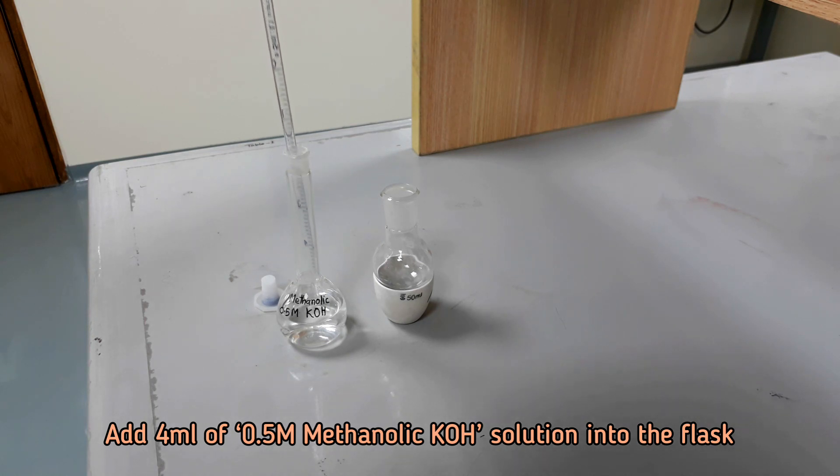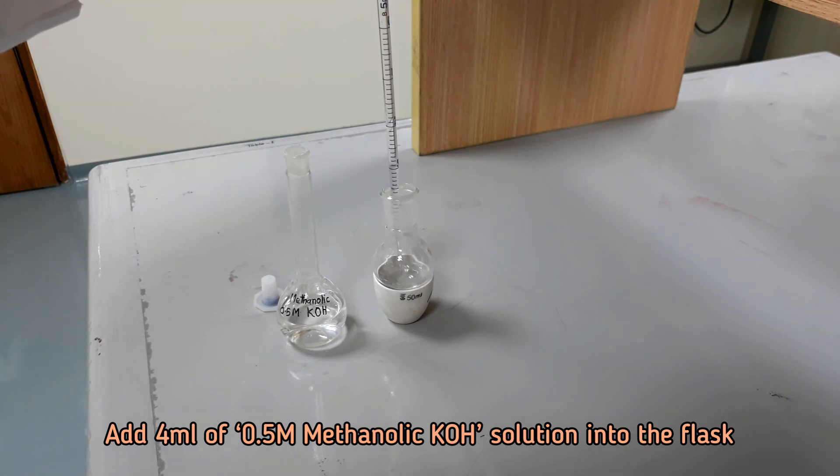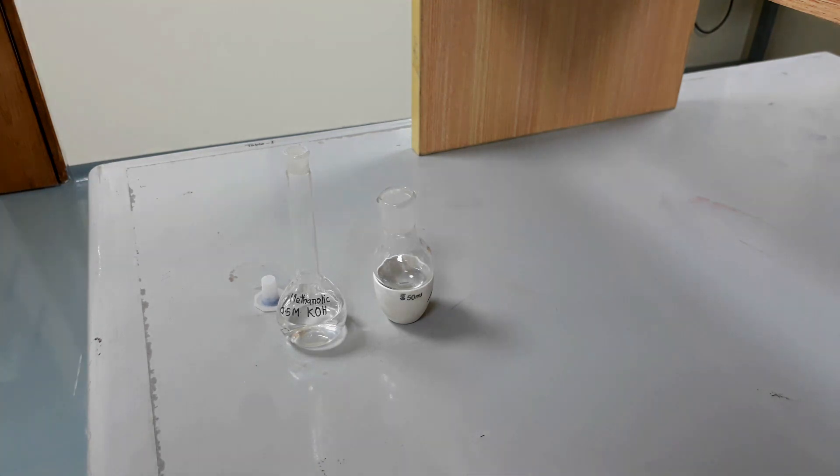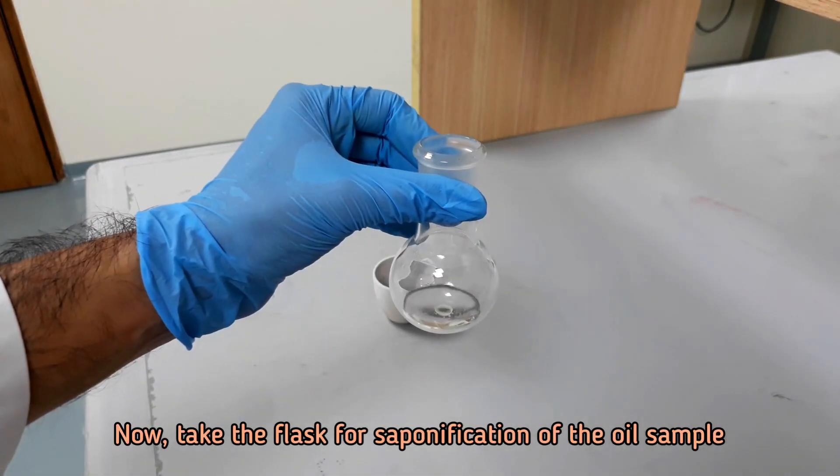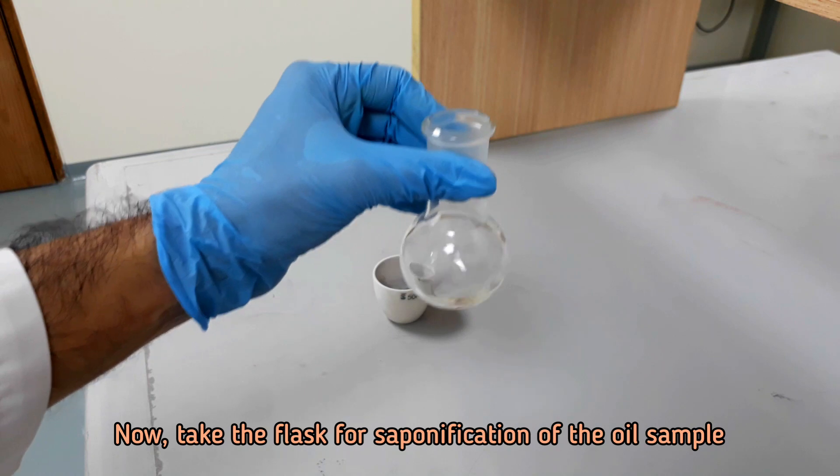Add 4 ml of 0.5 molar methanolic potassium hydroxide solution into the flask. Now take the flask for saponification of the oil sample.